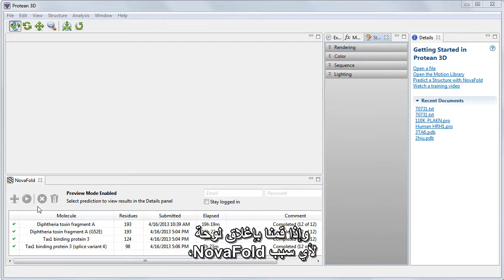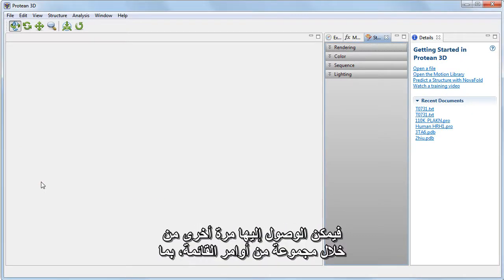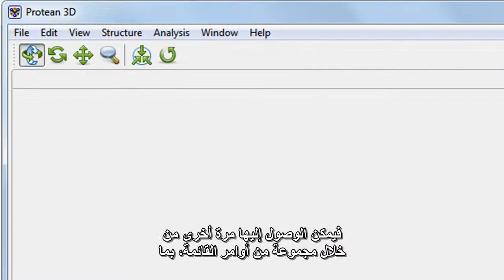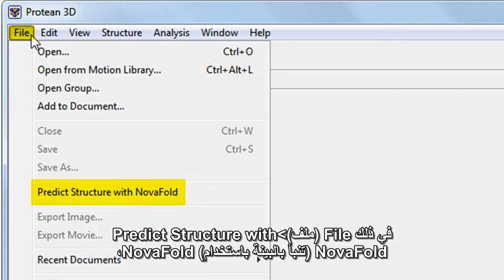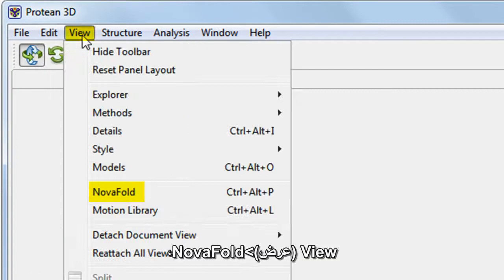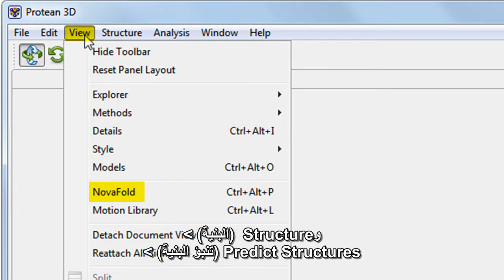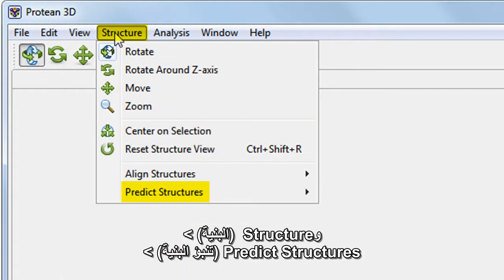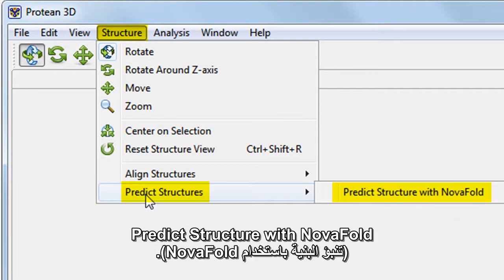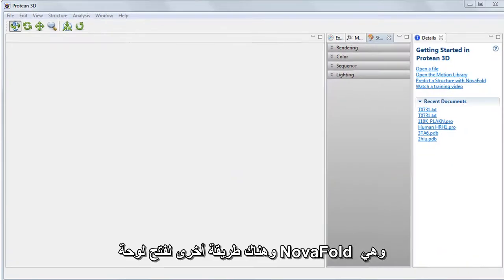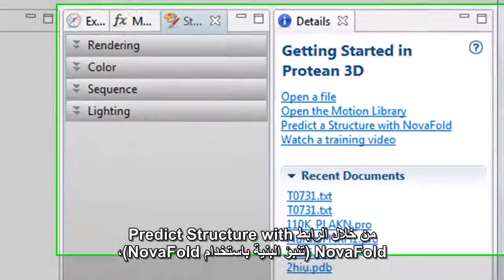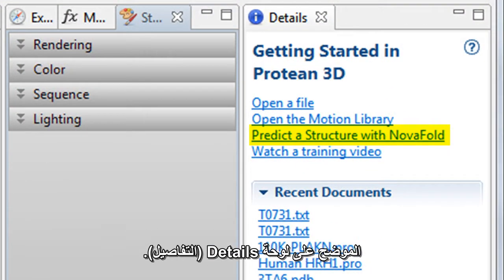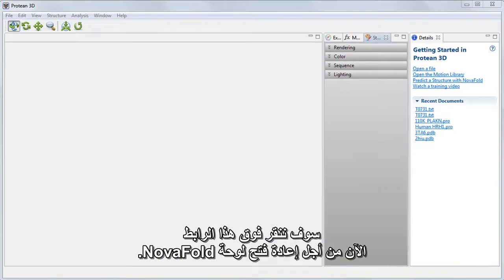If we close the NovaFold panel for any reason, it can be accessed again via a variety of menu commands, including File > Predict Structure with NovaFold, View > NovaFold, and Structure > Predict Structures. Another way to open the NovaFold panel is via the Predict a Structure with NovaFold link, which is shown in the Details panel. We'll click that link now to reopen the NovaFold panel.